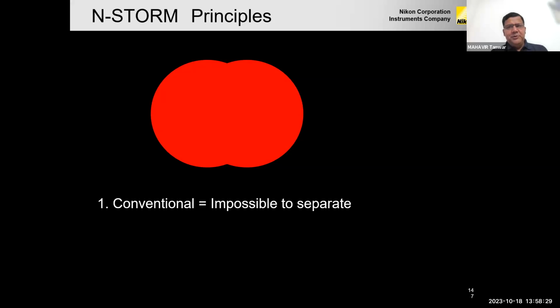So actually what is happening? Your question is very good. Why are we unable to resolve? Because the intensity of light is restricting us from separating those two dots, because the light is too much. So that's why we are unable to see what is happening in the background. We just see one blob. Yes, we have to differentiate these two points from the background, because if everything is illuminated, we cannot differentiate.